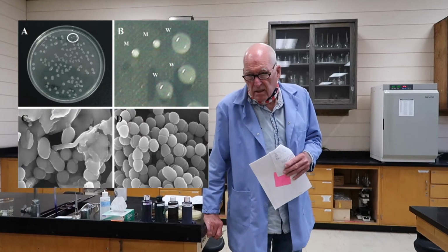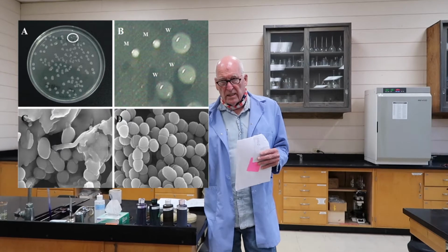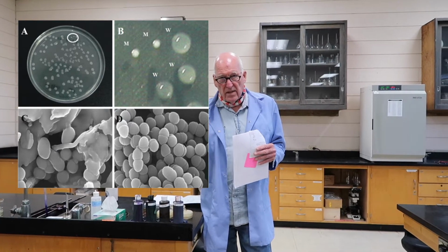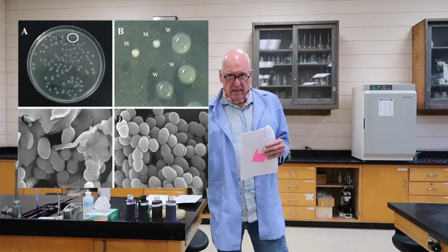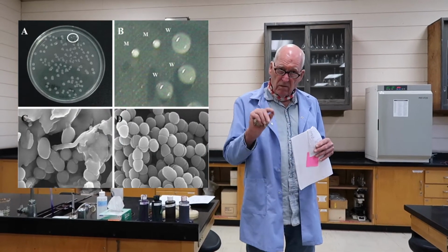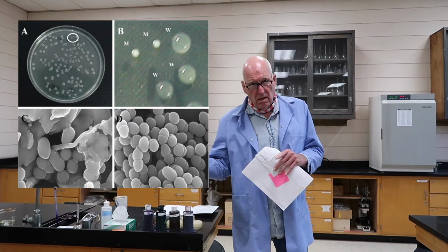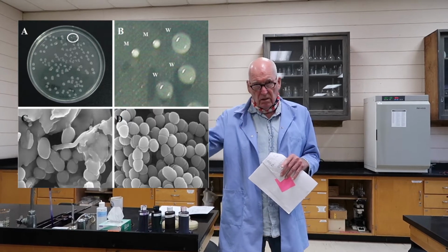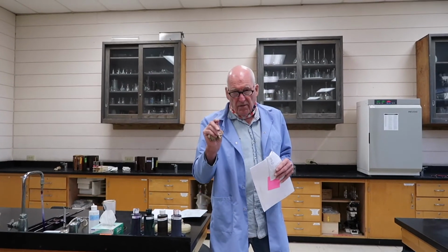And it's unique in the sense that it produces a very characteristic colony when you treat a media that contains high sucrose. So this organism has an enzyme that can take sucrose, which is a disaccharide, and convert it into dextran, which is a polymer, sort of like starch. You remember starch, its monomer is glucose, except this dextran is made a little different.